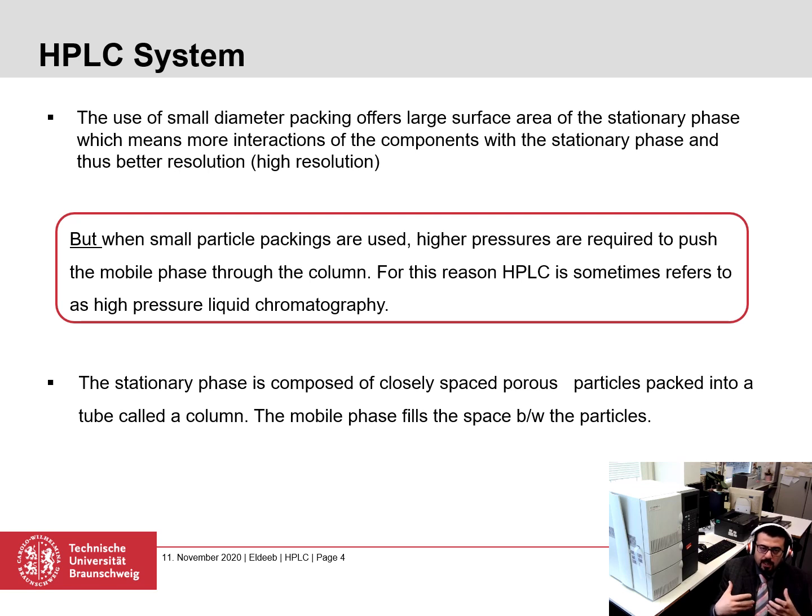However, when small particle packings are used, high pressure is required to push the mobile phase through the column. For this reason, HPLC is sometimes referred to as high pressure liquid chromatography.